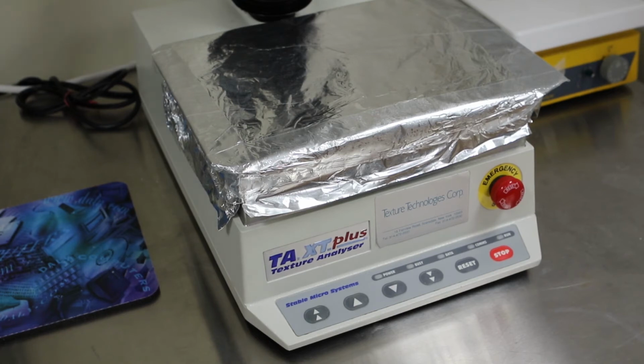Texture analyzer is an instrument that is used, the way we use it is to try to relate what you might experience as a consumer when you're eating food, for instance, and how that experience translates into quantifiable numbers. And again, the texture analyzer is how we use that.